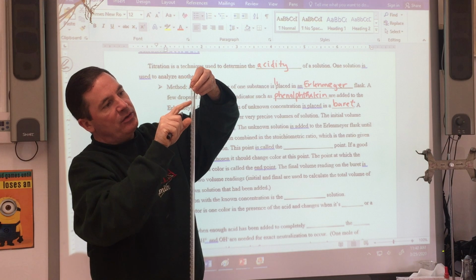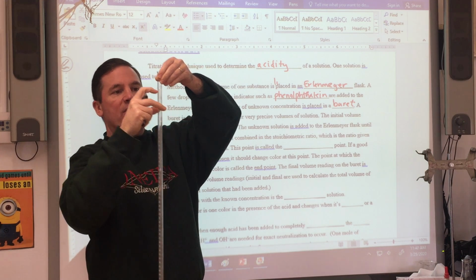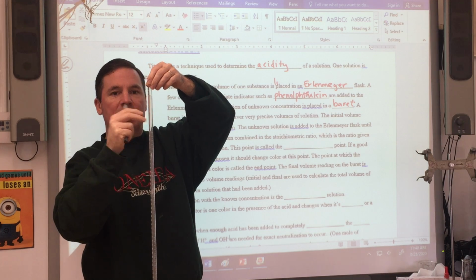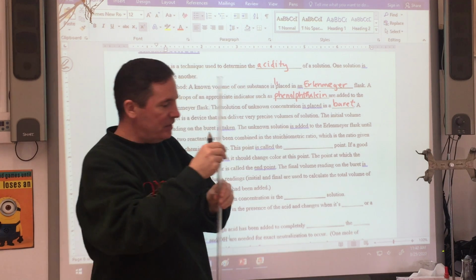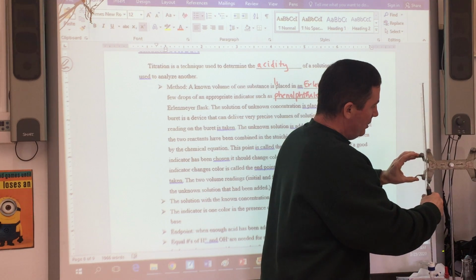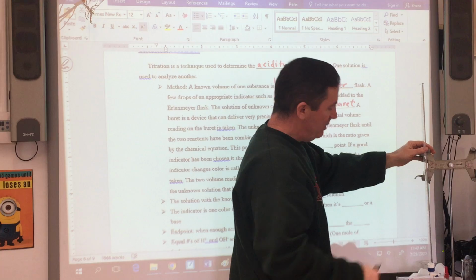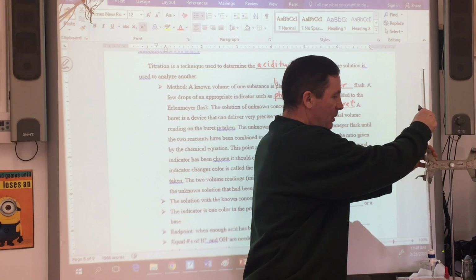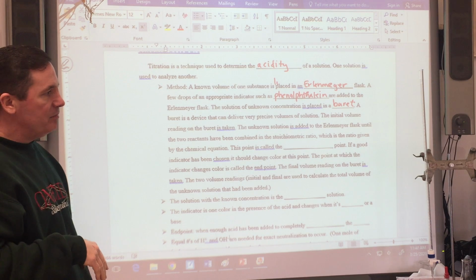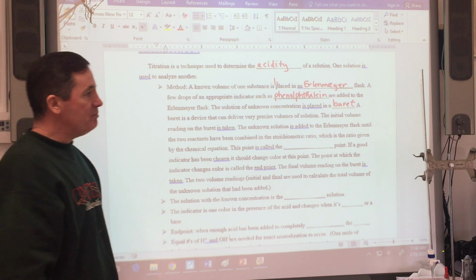So from here to 1, if I go here, it's not 1 point something, it's 0 point something. So the scale is different, and it's a little bit easier to lose track of yourself. You've got to remember that it's the amount that's getting added instead of getting measured.